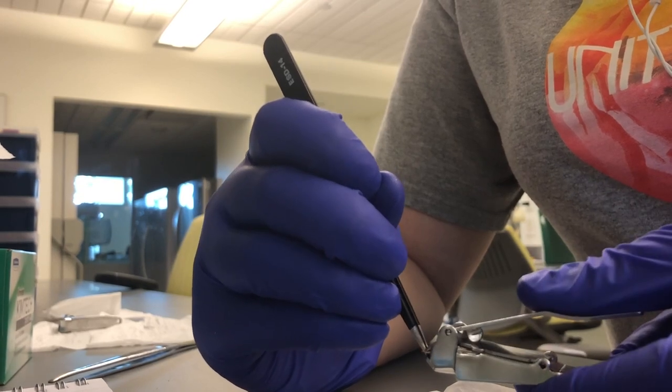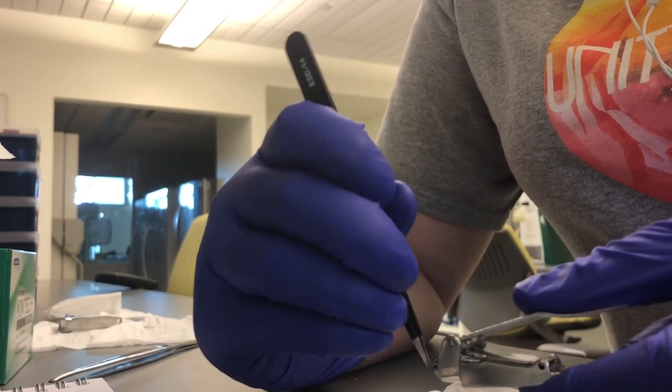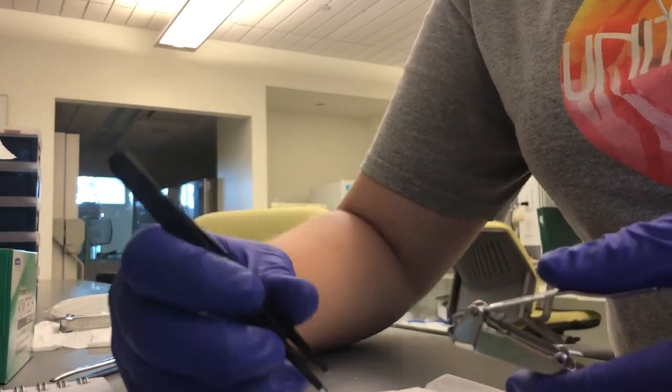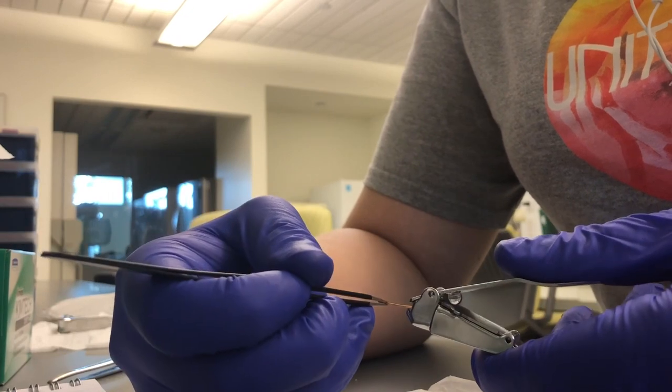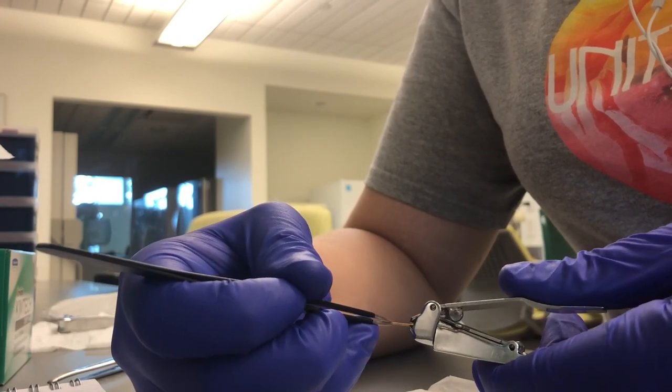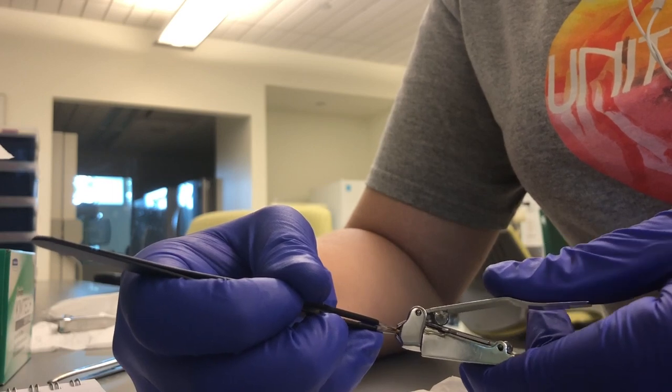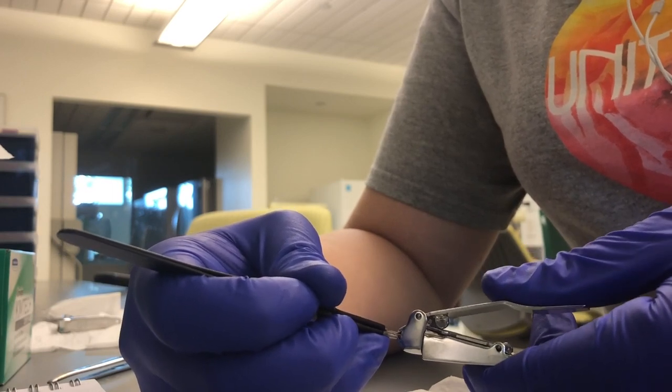Unlike other cactus tissue, such as flowers or the actual fleshy green part, the removal of spines does not damage the plant and it greatly reduces the amount of mucilaginous waste produced during the extraction. The use of spines also aided in decreasing the number of coprecipitants present when the DNA pellet was rehydrated.